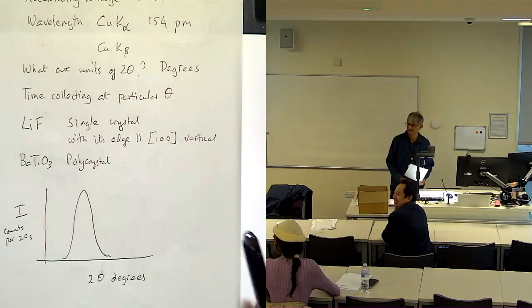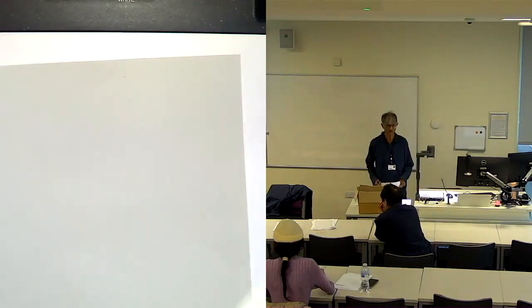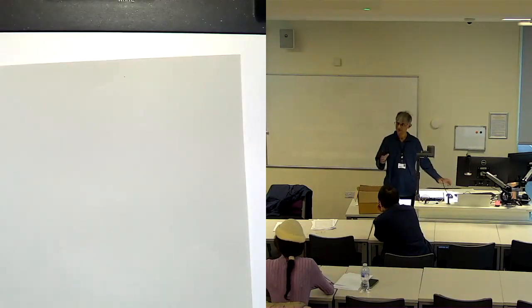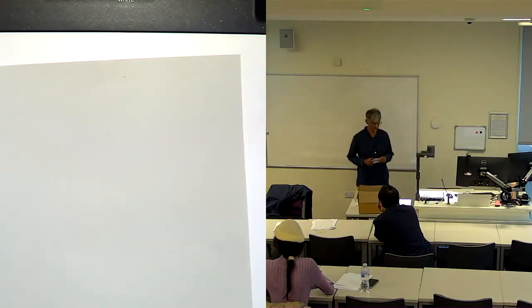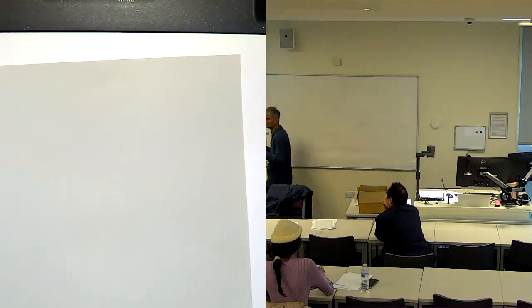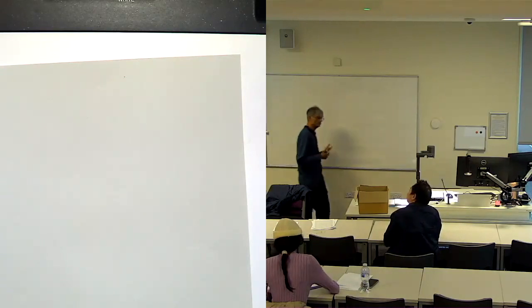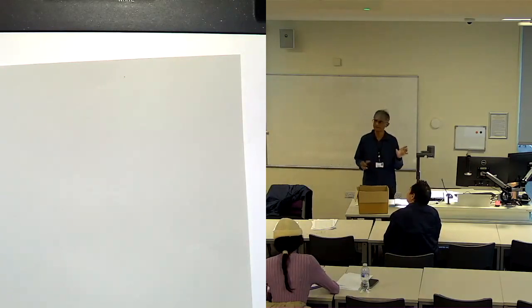Okay. Now, there's a couple of really interesting questions that were asked of you inside the practical handout. One of them was you had two peaks from the lithium fluoride, right? And they represented the 200 and 400 planes diffracting. That is something that you had been told in the practical handout. And you had to work out the lattice parameter from each peak.